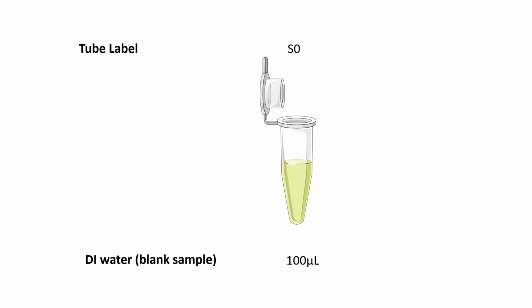Next, we're also going to prepare a collagen blank sample, which essentially has no collagen in it. So it's 100% deionized water or DI water, and this will simply be labeled as S0.